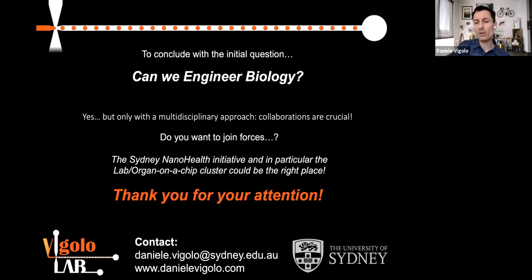Now, similarly, you can do similar things in other fields. So in tissue engineering as well, you can quantify. I think the quantification that is possible through microfluidics is really key. And again, it will enable essentially, well, you can create a series of experiments that are fully controlled, and that will give you the possibility to really test different conditions and extract possibly detailed information on how to create a new tissue or how to quantify the risk of a disease. These are all possibilities.